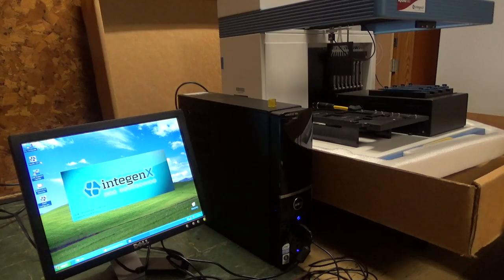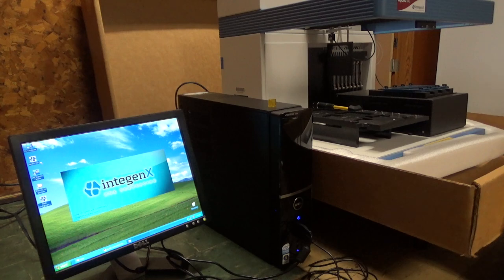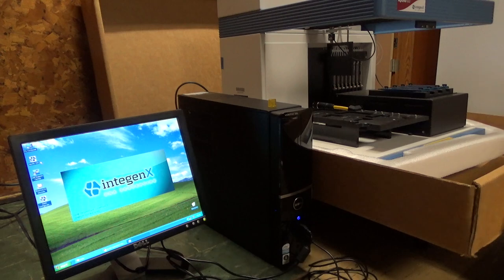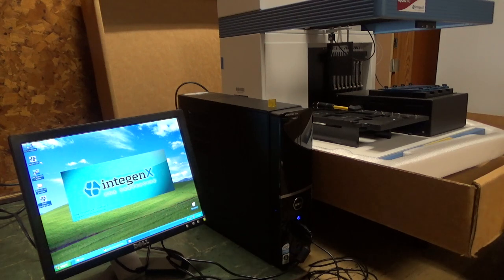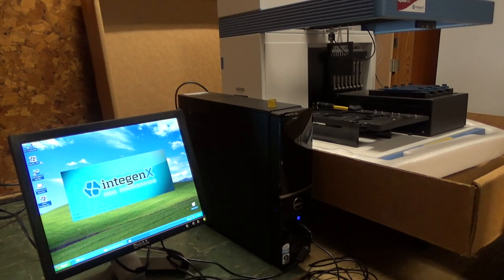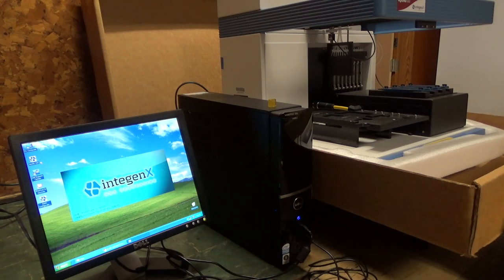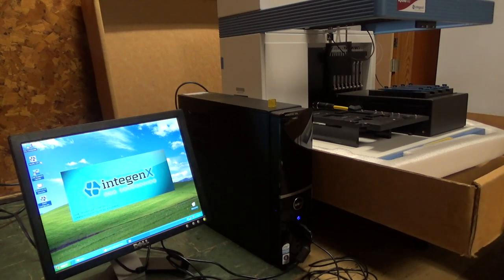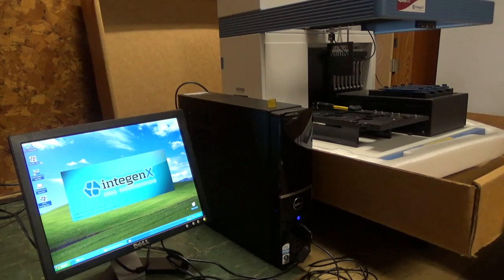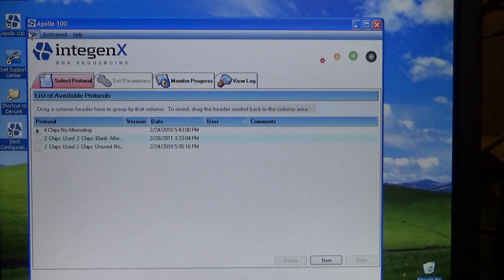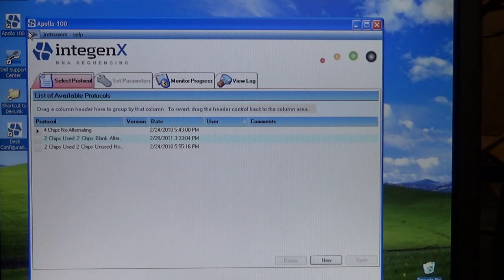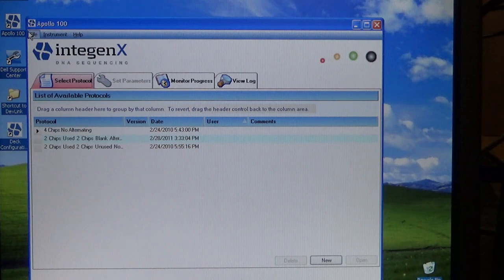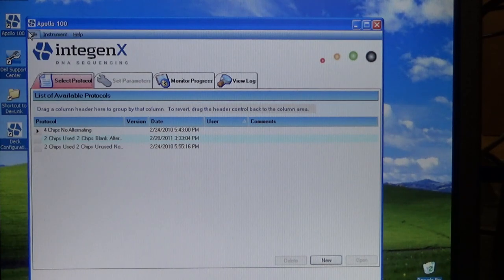All right, while this video is rapidly losing interest from my viewers due to nothing happening, I'm going to try this one more time. I have two USB A to A connections. I have the serial port connection, and we are going to try to fire this up again and see if it does stuff. All right, it made not bad noises this time. All right, progress! We finally have the software loaded without any errors or exceptions thrown.